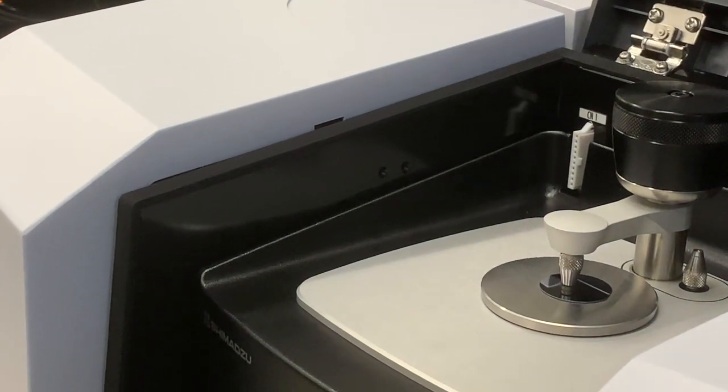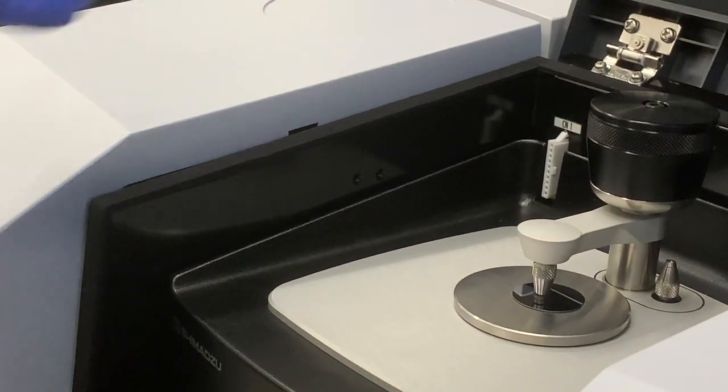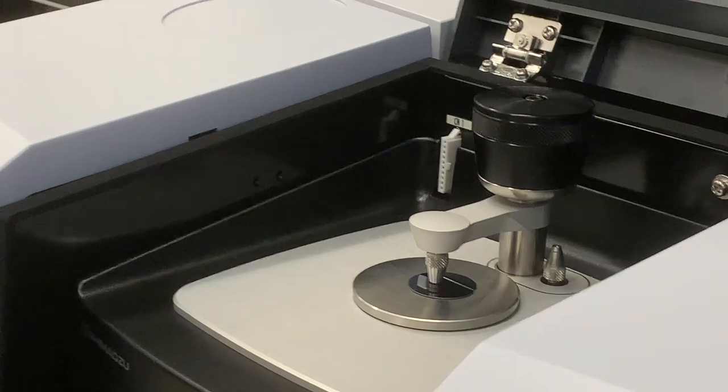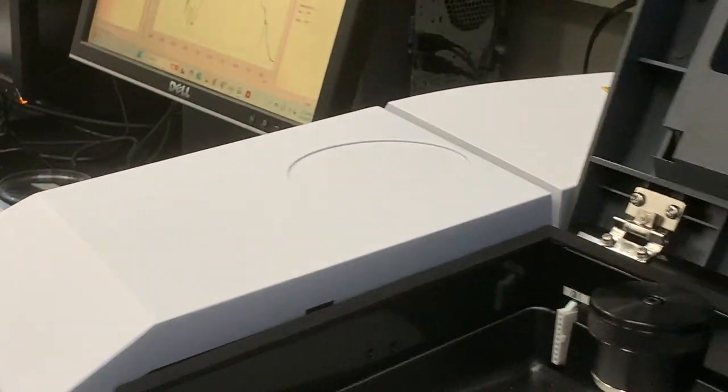I'm gonna check and see if we have any application notes on that. It's in contact, but I didn't apply very high pressure. You see, it's not flush yet. Yeah, so that's good. Let's run like this, and then do you mind if we try with the high pressure? It's up to you.